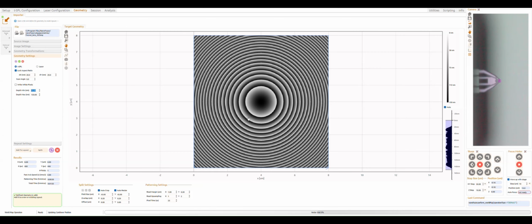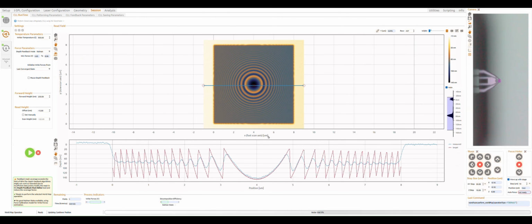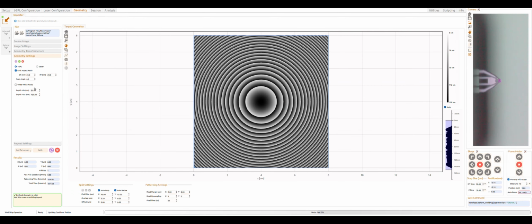This variation of depth cannot be easily achieved with the NanoFrazor because of the geometry limitations of the tip itself. So the software is already telling us, look, I'm a simulator, but probably your design is not so great, or you may have to change some stuff, especially if you use, let's say, standard PPA material.